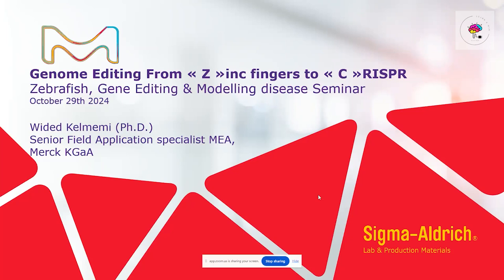My presentation is going to be a little bit more general. It's not going to be focusing on zebra or zebrafish, but it's more about genome editing in general. So what we can offer, what we can support you with, and also a little bit back to basics of the evolution of genome editing, and how the workflow looks like, and what considerations to take into account in order to have the best result possible.